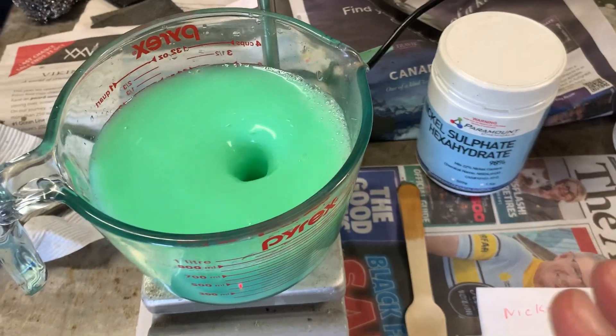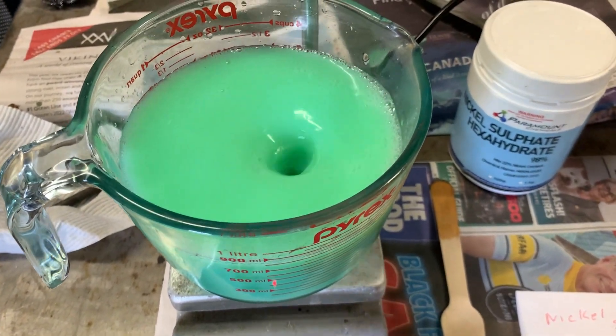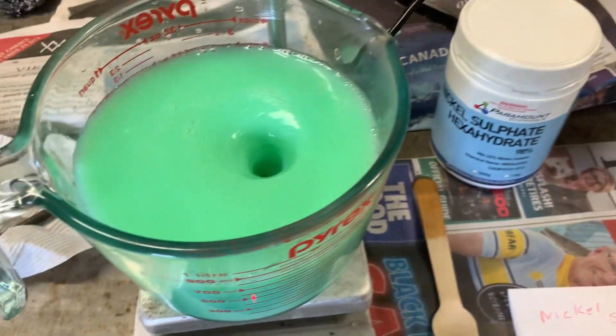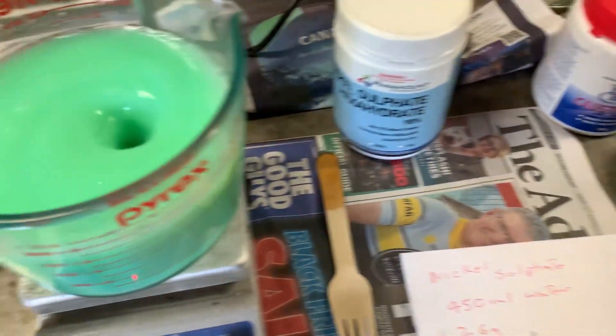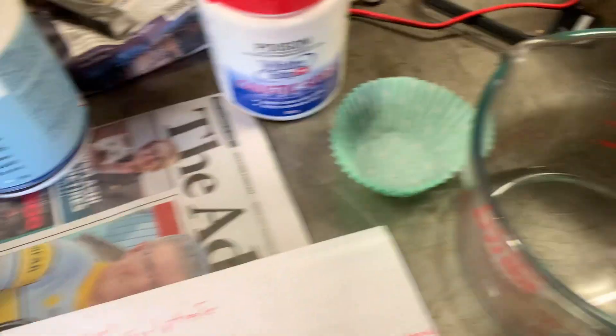Don't tip any of the liquid out into the drain — it's bad for marine life. Leave it in a container, let it evaporate, scrape the salts up, bag them and bin them. That's the best way to get rid of your solutions.